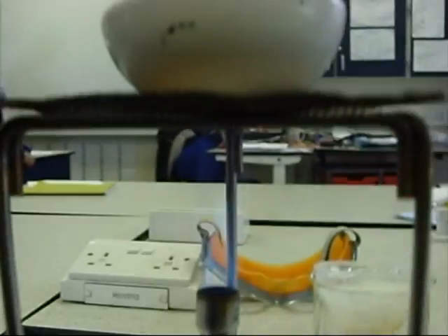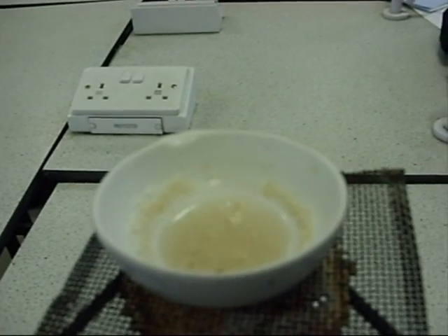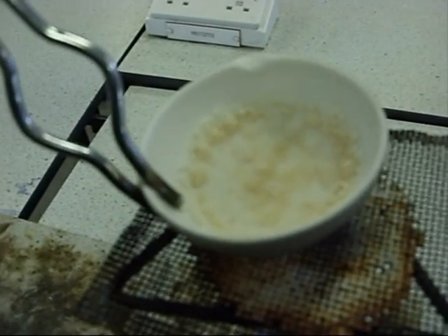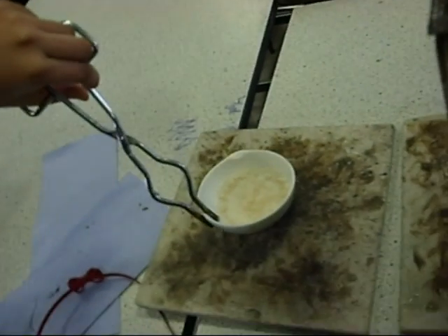Some crystals are forming. As you can see, the salt crystals have formed around the edges of the evaporating dish. Always remember to wear your goggles at this point. As soon as it's cooled down, remember to use your tongs to bring it to the mat. As you can see now, there are lots and lots of crystals that have been formed.